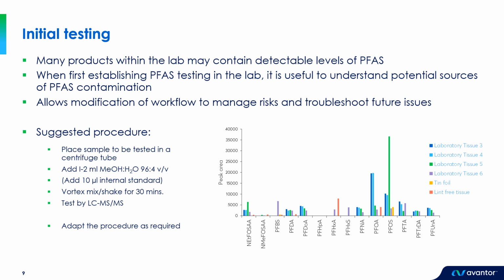So these are obviously all potential sources of extractable PFAS that, if we're not careful, could potentially contaminate the environment we're working on our samples in if the samples come into contact with them. Whilst it's not easy to necessarily eliminate those materials from the lab, we can certainly look to restrict or control their use to minimize those risks.